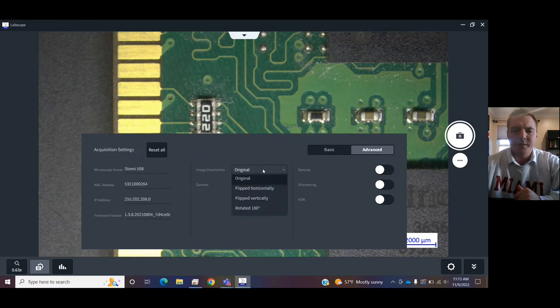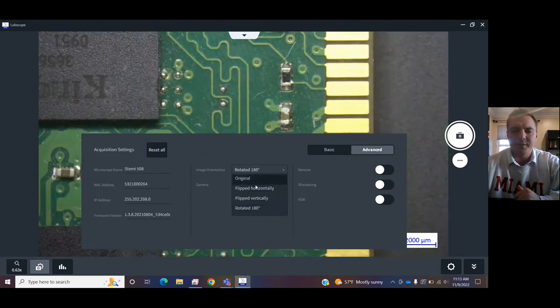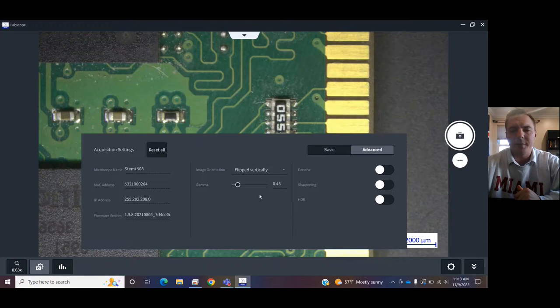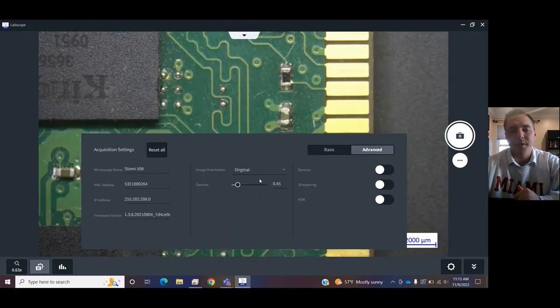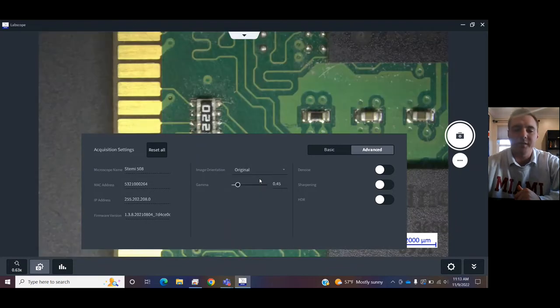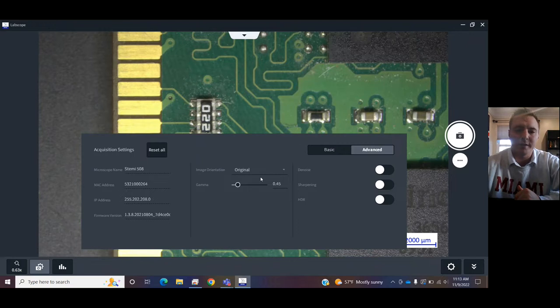In advanced, you can change the way that the image appears to you digitally. So, if the camera is mounted a certain way and it's screwing you up, you can change the digital orientation.